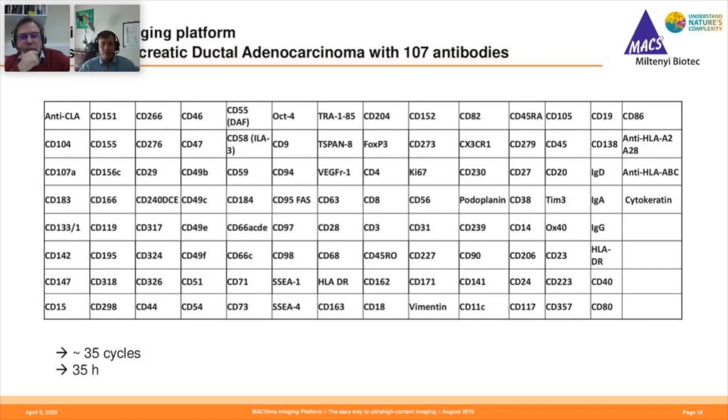Yeah, so that's our aim, really. We wanted to keep it open, so if people have antibodies for markers that we don't produce antibodies for, they can still run their experiments, because there's obviously going to be weird and wonderful things people are interested in that we don't make products for. But I think the majority of panels we would see being based around release. They're also quicker, because the photo bleaching has to go around with the field of view of the objective and take the time to photo bleach every single field of view. Exactly, yeah. So you can put this one solution on and it makes it much simpler. So we're building our portfolio on that releasable side of things massively at the moment, but it's not fully there yet.